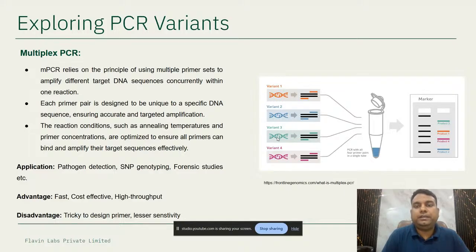So more than one primer can be used in a single PCR at the same time, but the condition is that their PCR products should be of different sizes. Where is it used? When we have a sample which is rare or present in a very small amount, or we need multiple tests for confirmation of a single disease.